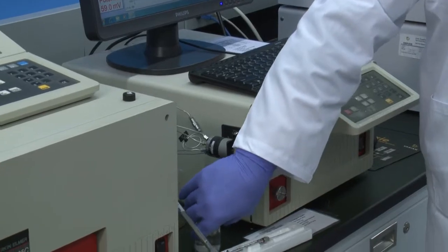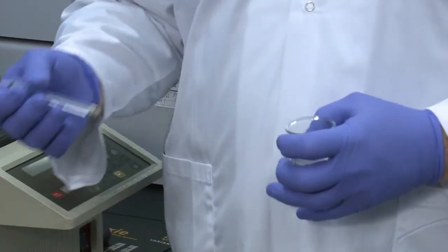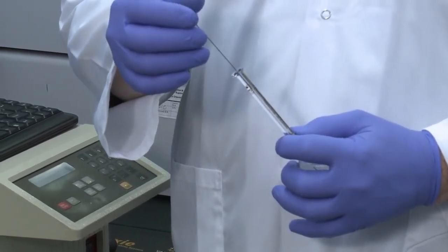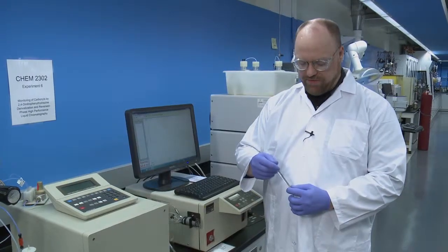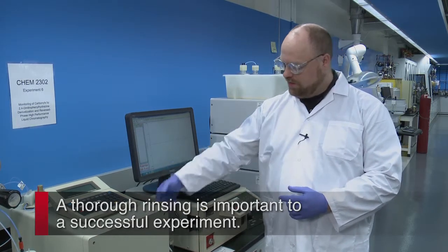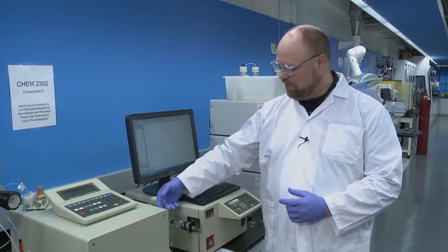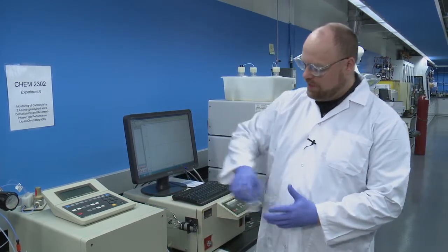First thing that you're going to want to do when you come to the system is you're going to want to rinse the syringe. So you can use whatever solvent that your TA or the lab coordinator tells you to use. And all you're going to do is rinse the syringe and expel it to waste. You're going to want to do that about 15 to 20 times when you first come to the instrument. And you're just going to do that.